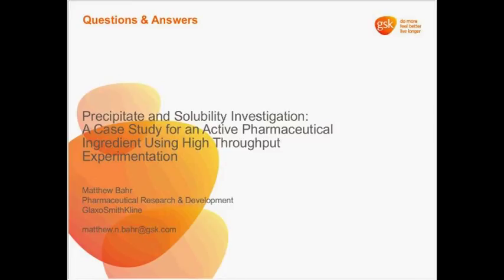So essentially, if I went beyond 7 milligrams in each of those vials, it really wouldn't be a realistic representation. I need to consider what would be a realistic representation of the drug to excipient ratio that's in the tablet formulation. Okay, excellent.